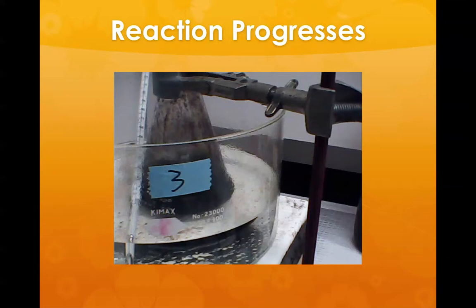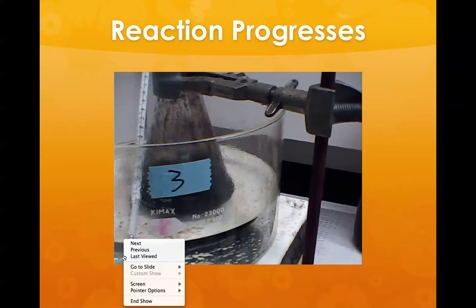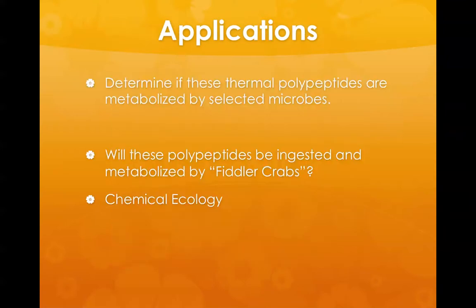soluble. It'll darken. We're doing the reaction intentionally in the open atmosphere, exposure to oxygen, and later down the road we'll do the reactions as described in the patent under a blanket of nitrogen gas. But let's go back to that a minute.